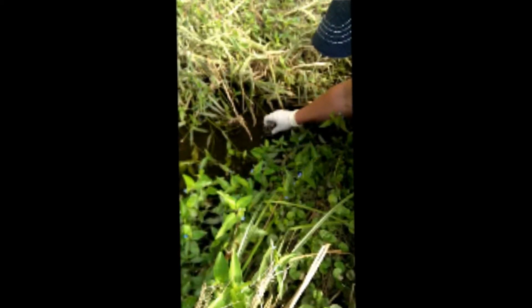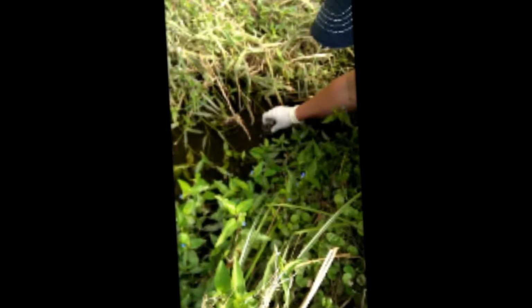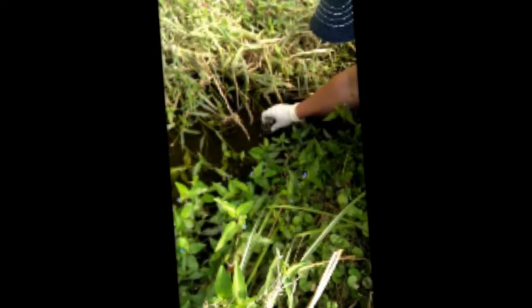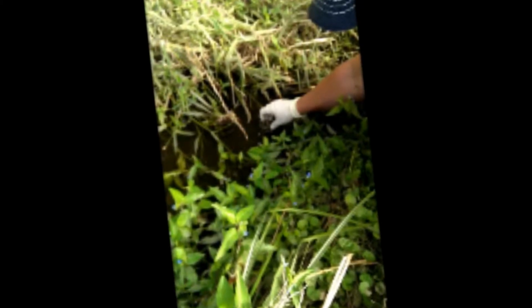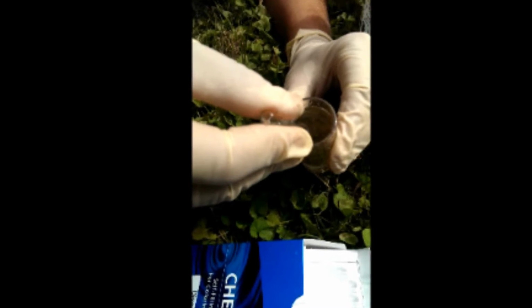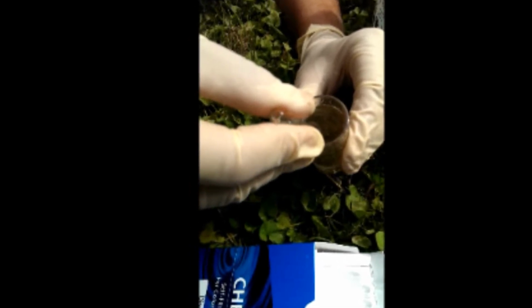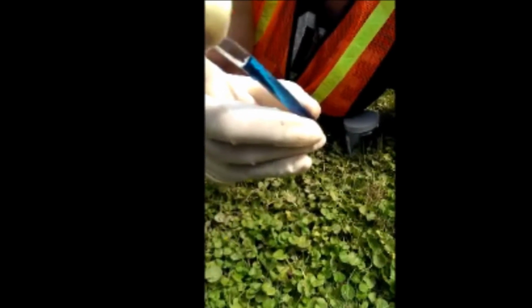Once samples are collected, a DO measurement should be taken to determine the dissolved oxygen content of each sample location. Take a 25 milliliter sample container and fill it with the designated water sample. Next, take a Chem Met sample vial and insert it into the container with the water sample. Press the vial gently against the wall of the container to break the tip off. Allow the vial to fill up with water.